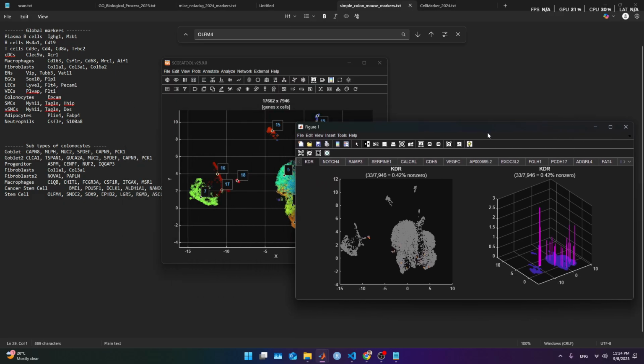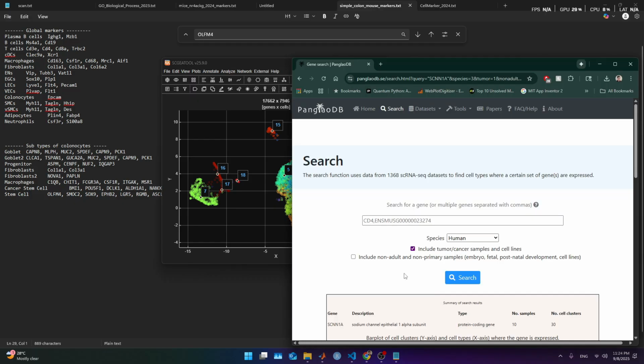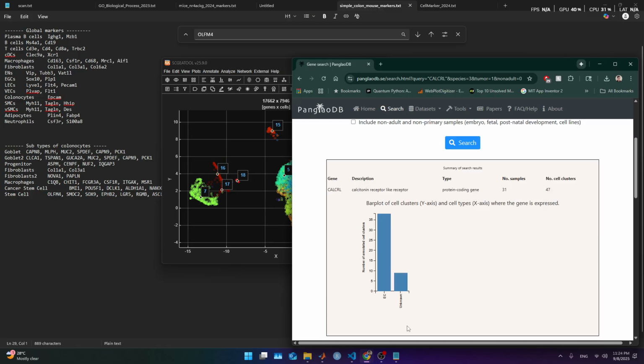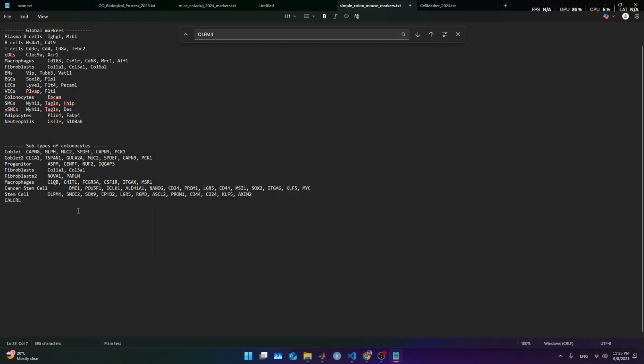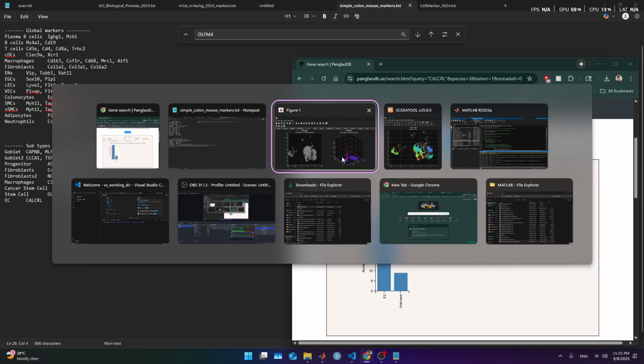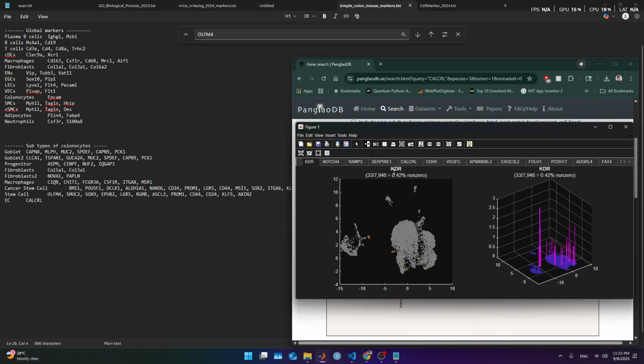Okay, very few, I don't think. Okay, that might be fine. Let's find out what that gene is. Enteric glial cells. Enteric. Easy. Enteric. What that is? I forgot. Easy. We can just label there. KDR.